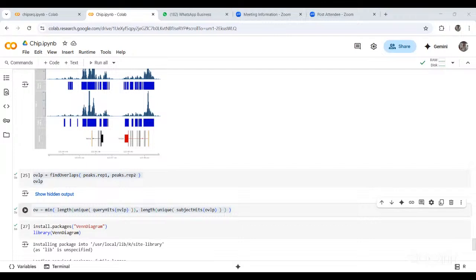I hope everybody has got these results. I have hidden this particular output. Can somebody share the screen? Pratima, Hamsini, Saeda, Pratima, can you share the screen? Yes, sir.